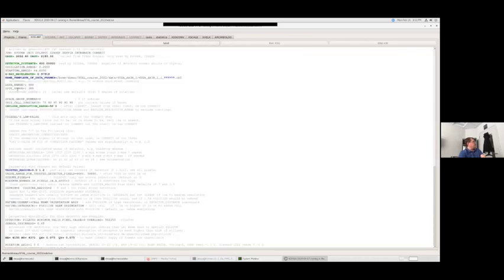So that's correct. And then the defaults for XDS GUI is it's going to take the whole data range, 1 to 600. And then for spot picking, it uses half the data set, so it does 1 to 300. And you can look into various ways of doing that, but that's a good compromise. The bigger your spot range, the longer that the spot picking step is going to take.